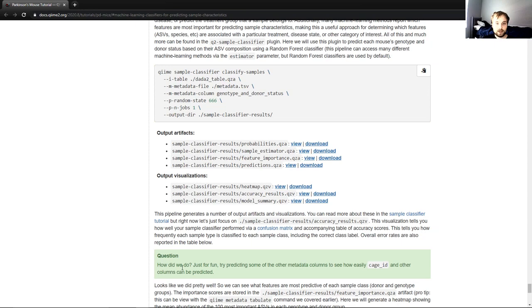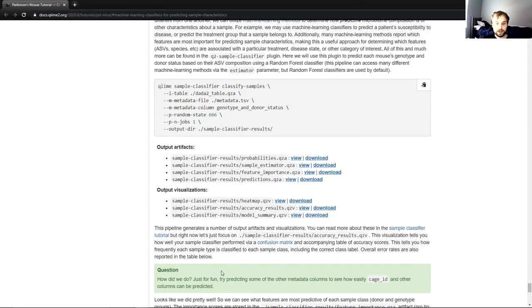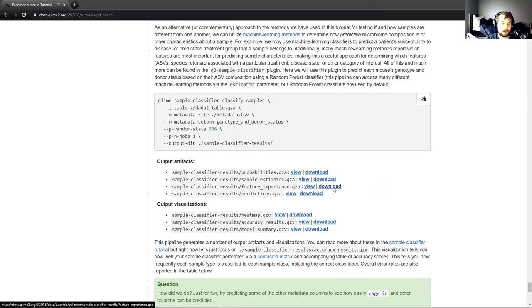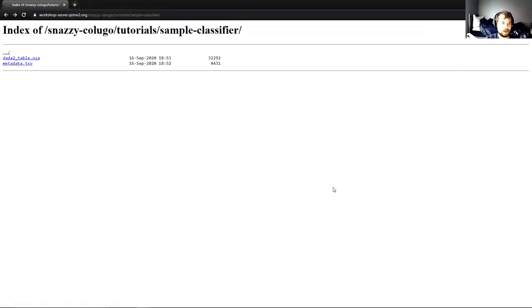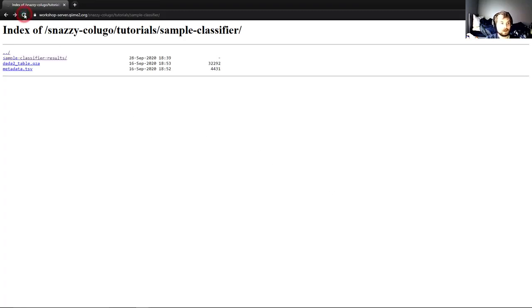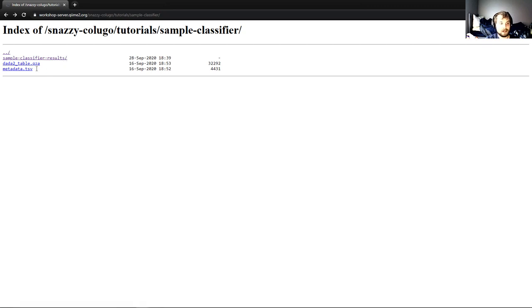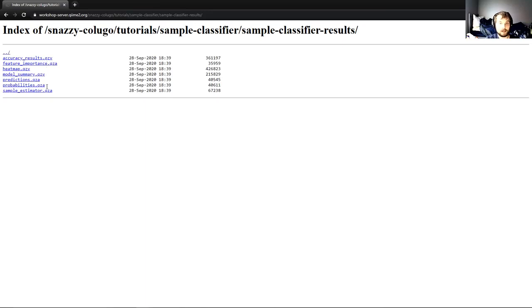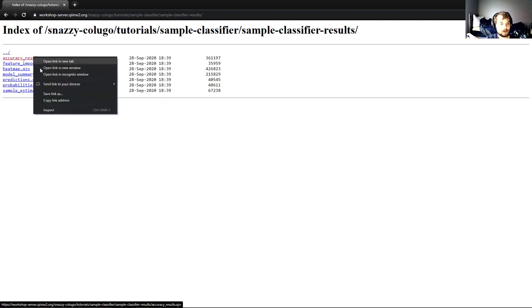How well did we actually assess the genotype and donor status of our different samples? And the way we do that is by looking at our accuracy results QZV. In order to do that, I will go over here to our remote sample classifier tutorial directory. I will hit refresh, and you can see that we have sample classifier results here now. And this slash at the end means that this is actually a directory as opposed to just a single file. If I click on this, you can see we have our QZVs and our QZAs that were output from the command we just ran.